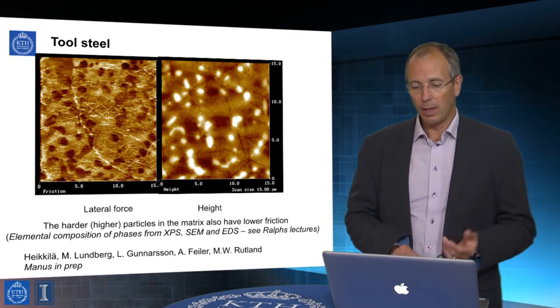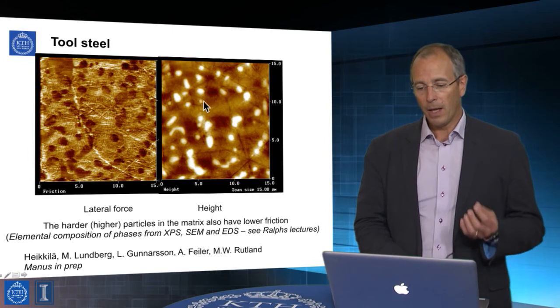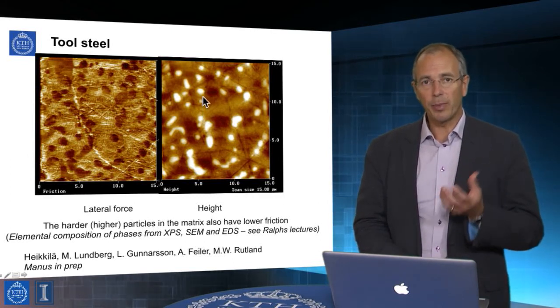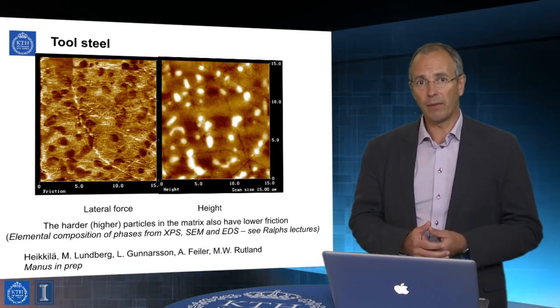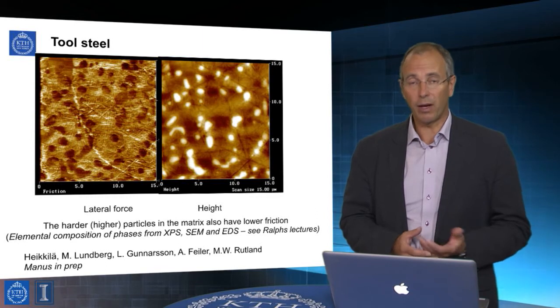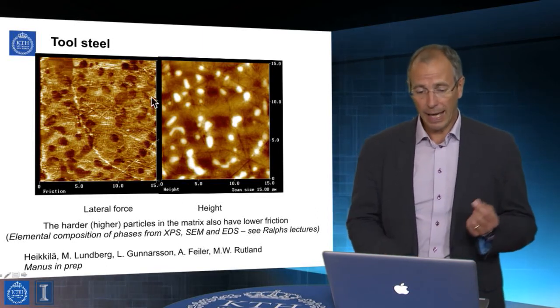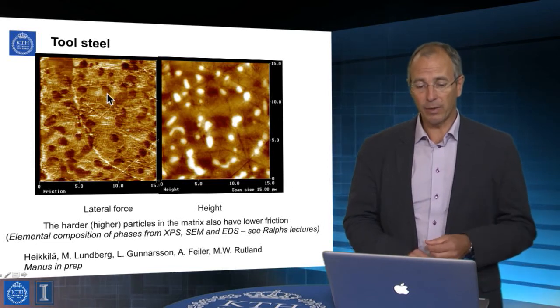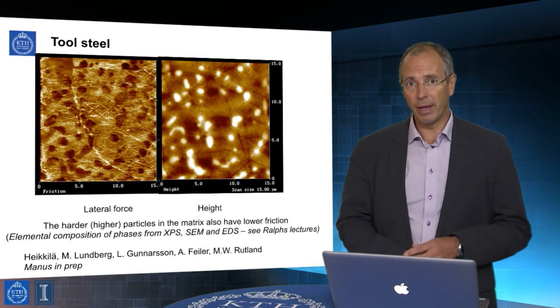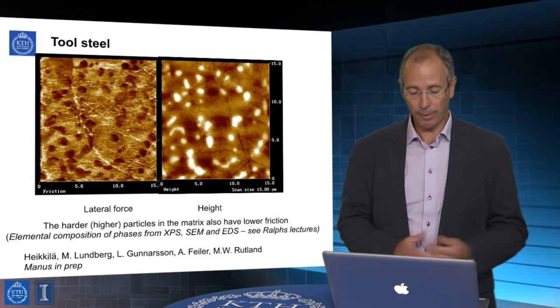But you can see that, once again, as we look at the surface, these topographic aberrations or asperities, which are in fact hard phases embedded in the steel matrix, in this case with a high nitride content, are proud from the surface, and they are obviously chemically very different. And it turns out that that chemical difference leads to a benefit in the material properties in this application.